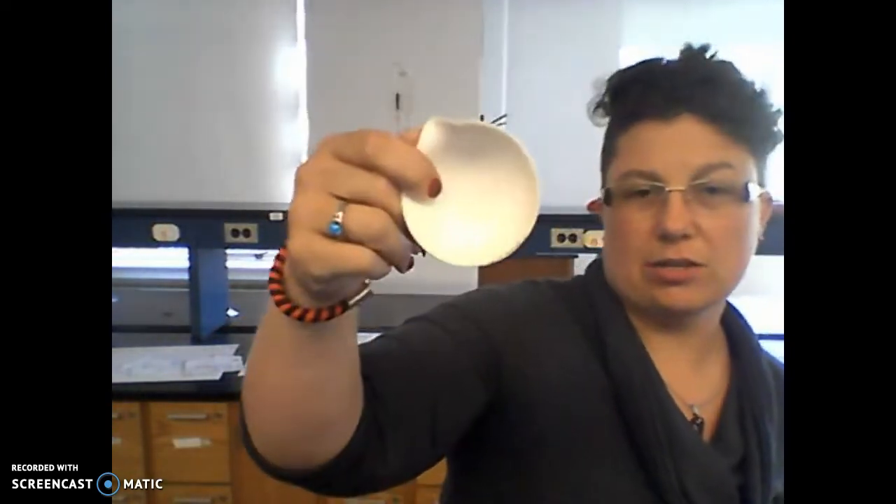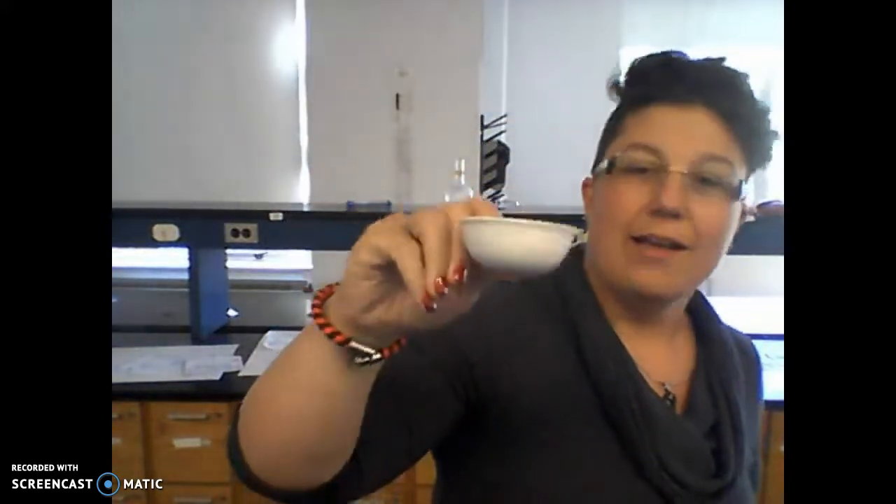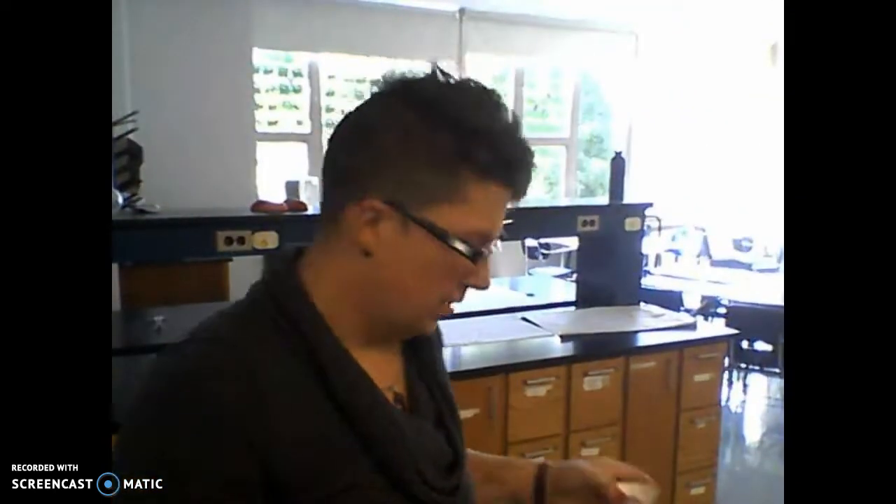You'll also see an evaporating dish. Evaporating dishes are used to put small amounts of liquid in so it can evaporate faster — we put it on a ring stand. Then there's a watch glass, which looks like this. The watch glass usually goes on the evaporating dish. There's a hole in it — it helps keep things in. We don't usually heat the watch glass directly because the glass will shatter.